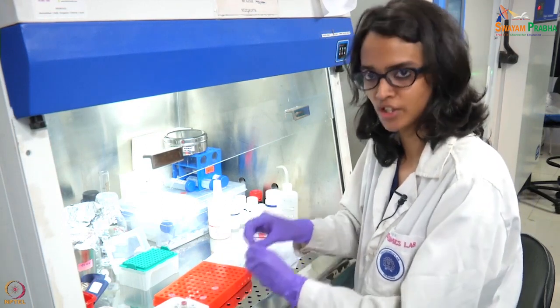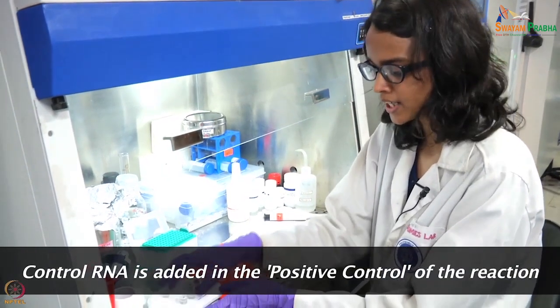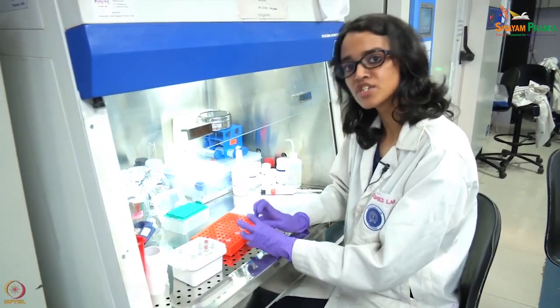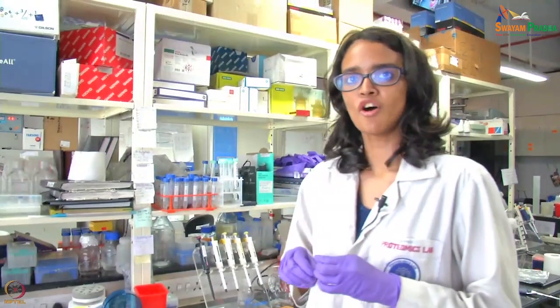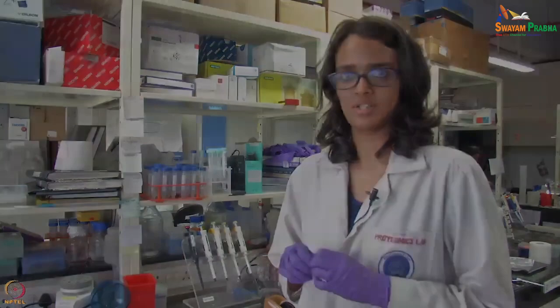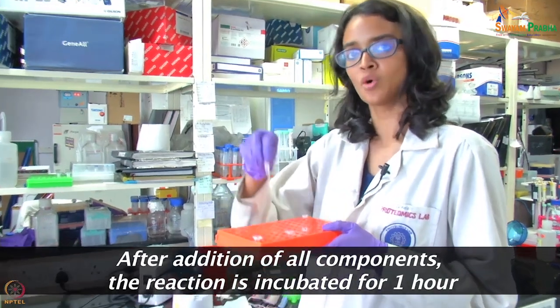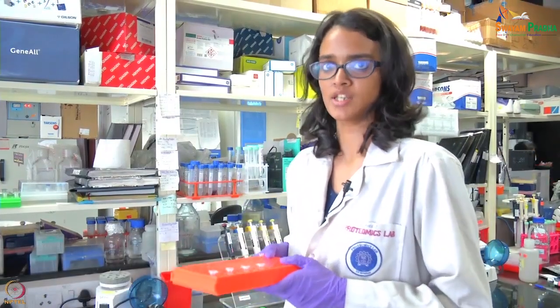The third control is the positive control. With the cDNA kit that we are using, we also get a control RNA. This reaction will have all the components of the reaction mixture, and instead of adding our sample as a template, we will be using the control RNA as a template. After addition of 50 millimolar EDTA, the tubes will be incubated at 65 degrees for 5 minutes. After setting up the control and sample reactions, we will now be incubating the sample tube, the no-reverse-transcriptase control, no-template control, and the positive control tubes at 42 degrees for 1 hour.